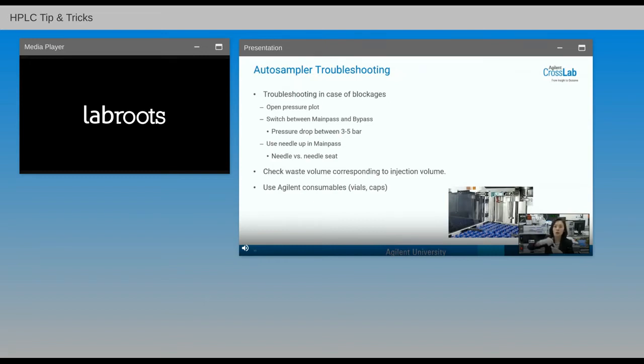You draw this volume, and then you inject into the column. When the result is out, then you plot to see whether the curve is linear. By right, with different injection volumes, the area count should increase gradually, or even the peak area should increase gradually, and that should give you a linear curve. If the curve is not linear, it could be due to the rotor seal cross port being leaked, or the injection valve not being tight, metering device seals leaking, or even needles being partially blocked.